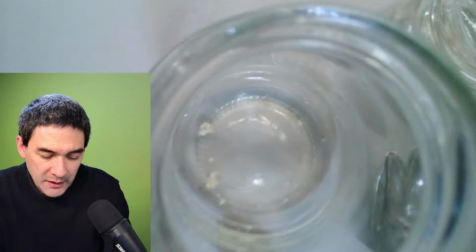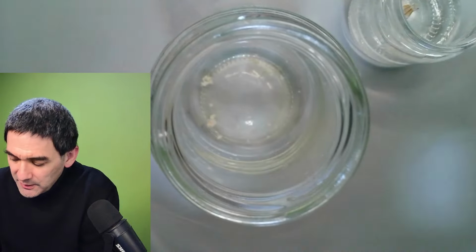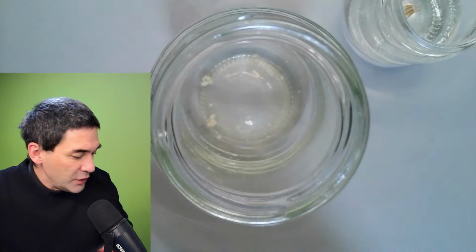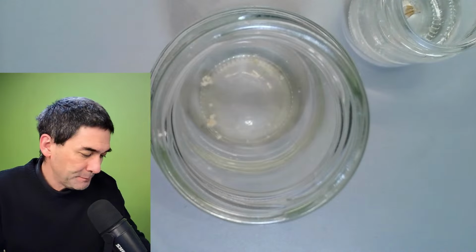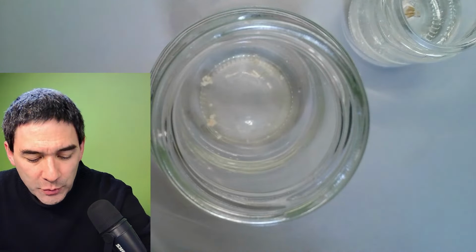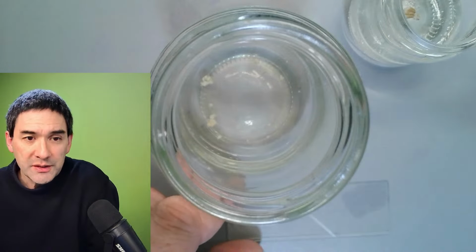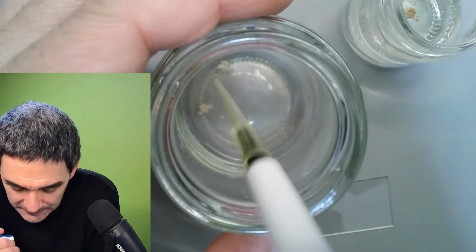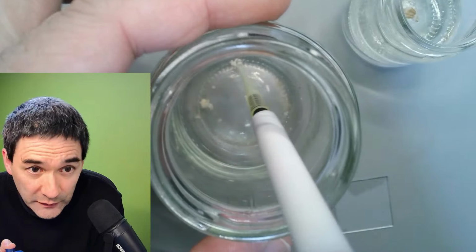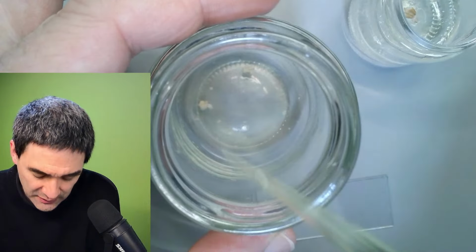And then what we can try now, in the last couple of minutes, is still have a look if any changes happened from last week. So again, I'm running out of microscope slides already. I have to wash them again. So what I'm doing now is the following. You go in here, directly into the cereal, and you take a small sample.